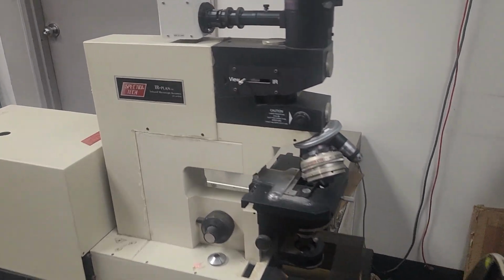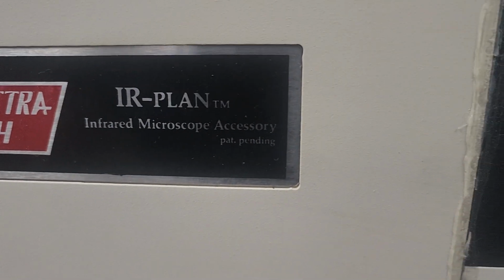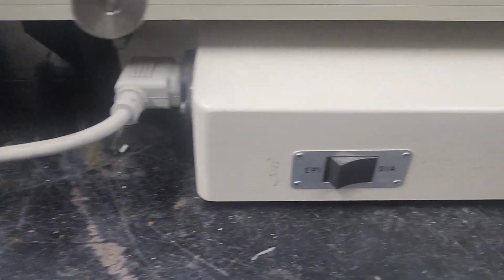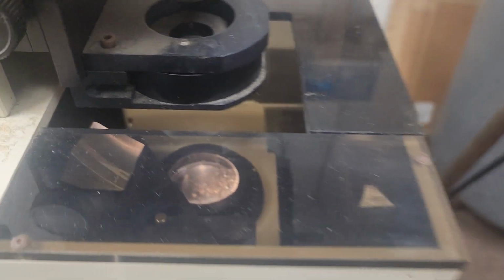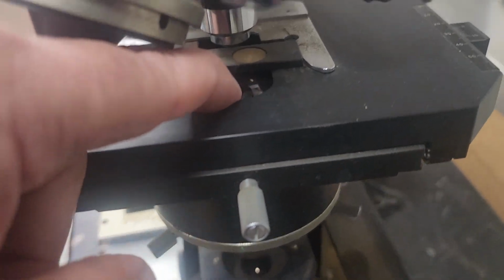This is a Spectra IR Plan infrared microscope accessory. Right now it's set up in reflective mode. I have it powered on. You can see the light coming up through there. I can see the light here, and I can see the light here.